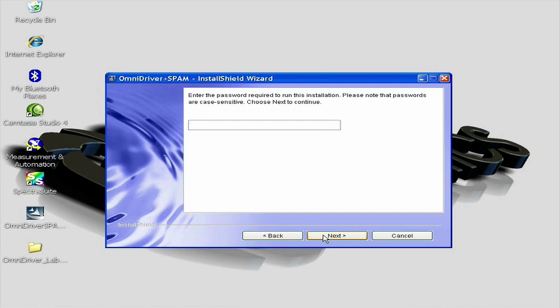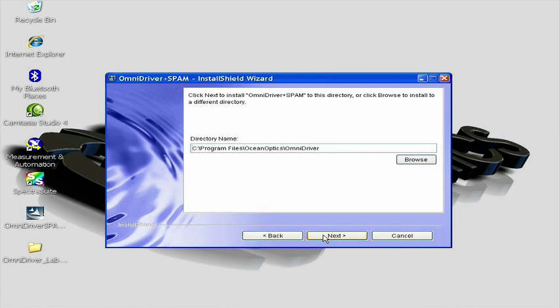At this screen, you will be asked to enter your password for Omni Driver. Please note that your password is case sensitive. Once you've typed in your password correctly, click Next.